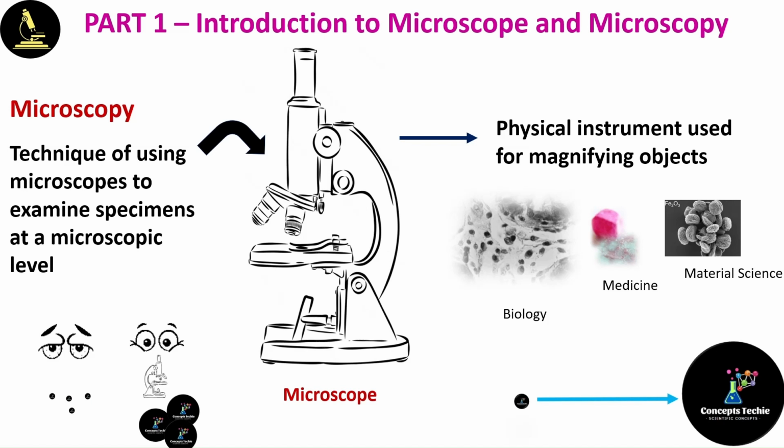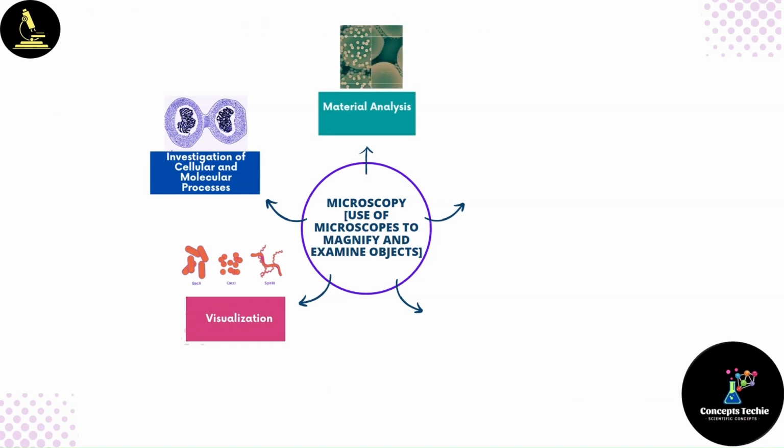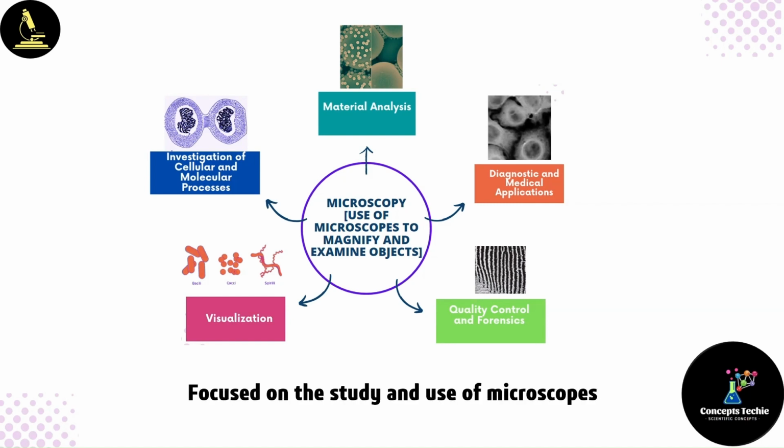Microscopy enables the study of a wide range of samples including cells, tissues, microorganisms, nanoparticles, crystals, and other small structures. So microscopes can utilize different imaging modalities and techniques to capture and enhance the visibility of microscopic data.